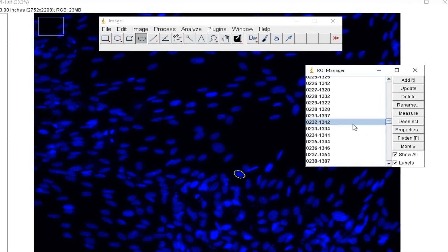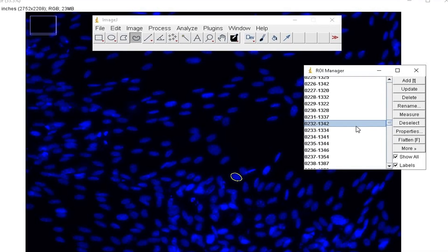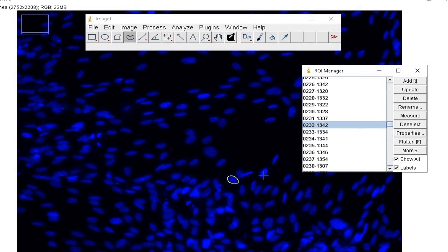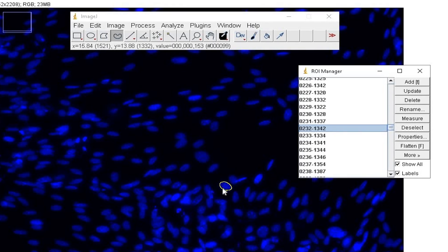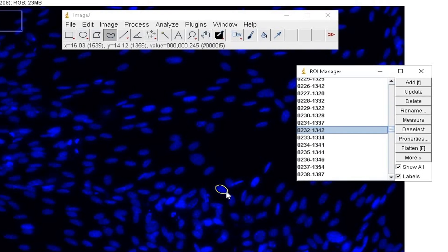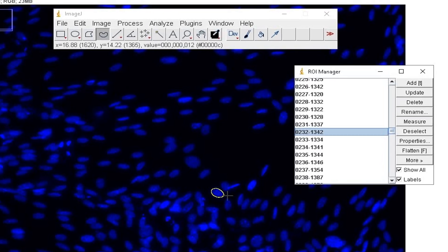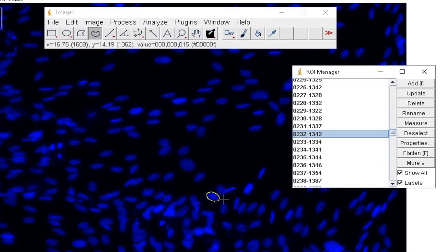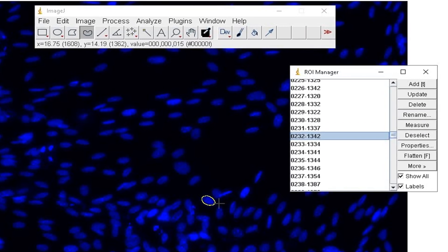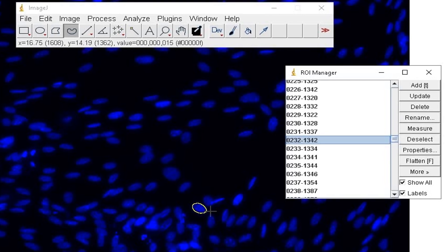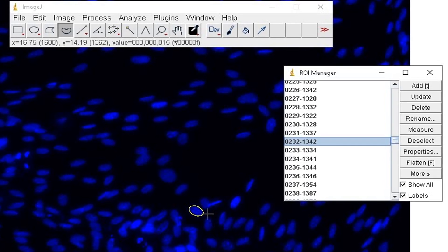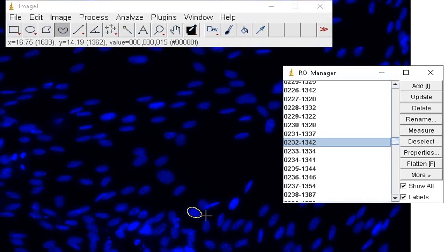Clicking on the individual cell numbers in the ROI manager dialog box would point out the cells in the image stained with DAPI. Check the show all and the label options.